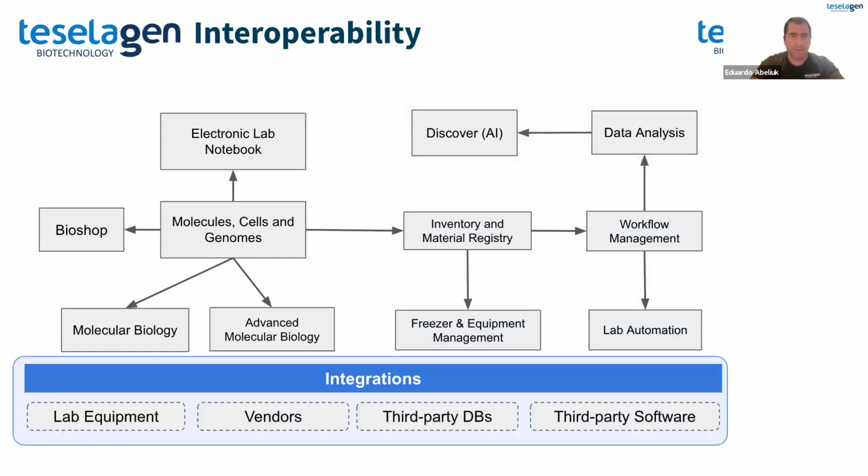Finally, our platform would not be complete without a series of powerful interoperability tools that allow it to connect to different third-party systems, such as lab equipment, different vendor APIs, and third-party databases, and also a number of third-party software tools.